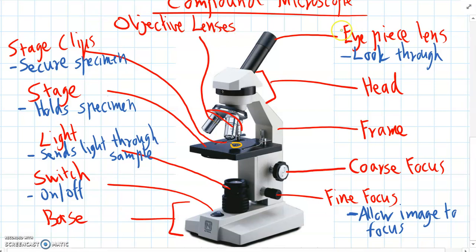And combined the eyepiece and the objective lens, this is what actually magnifies the image specimen.